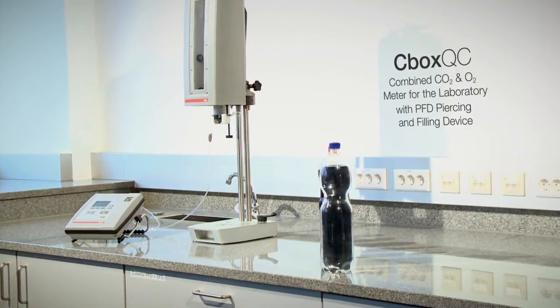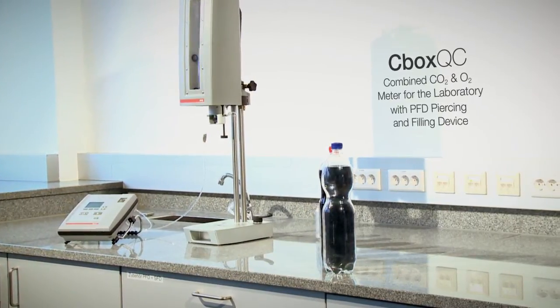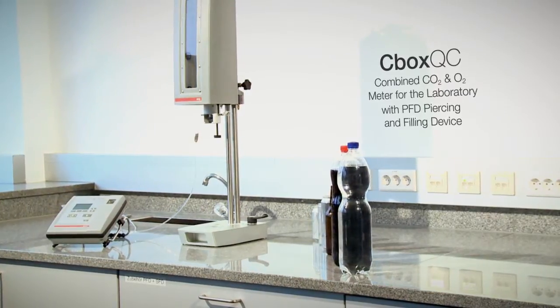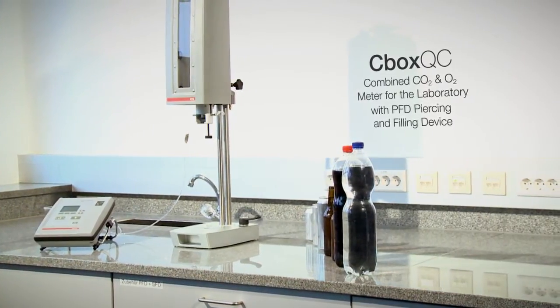Whether from glass bottles, PET bottles, or cans, the determination of dissolved CO2 and O2 is a frequently performed task in beverage production.